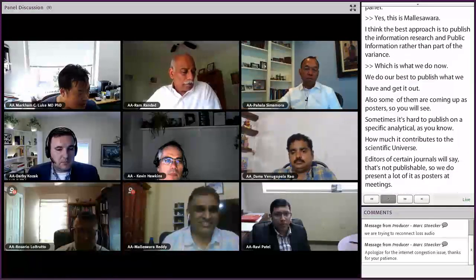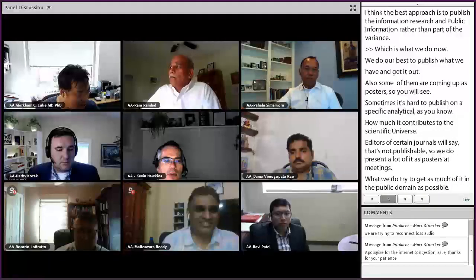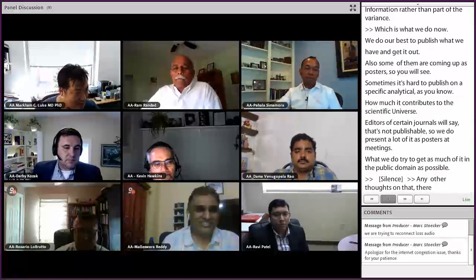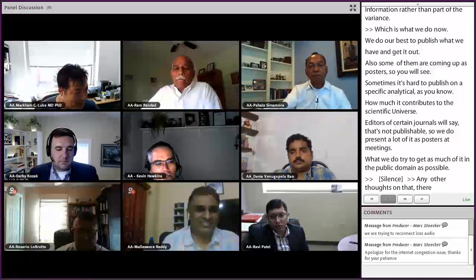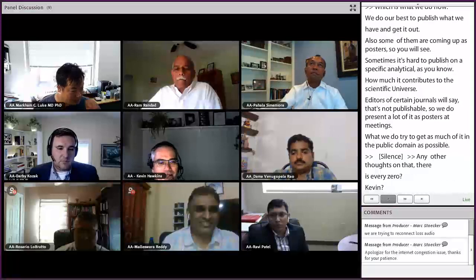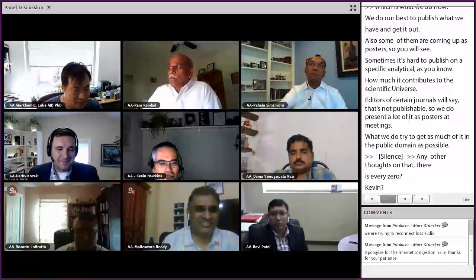Any other thoughts on that, Rosario, Kevin, Dama? Yeah, I kind of echo what was said before. We don't want to be too specific. At the same time, if something is known, for example, if you're doing X test, don't use a quartz cuvette, use a different type of cuvette, that could be helpful if it's listed in the guidance as a specific technique.